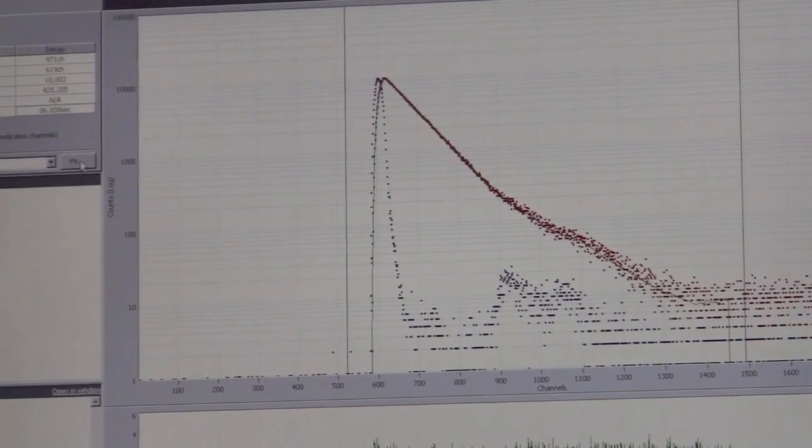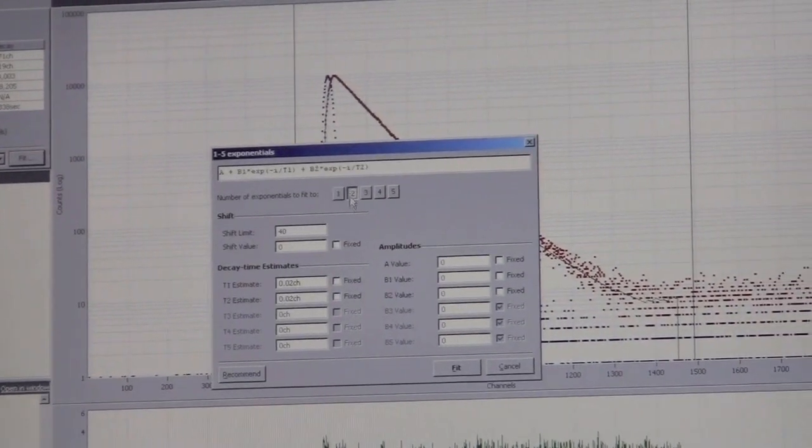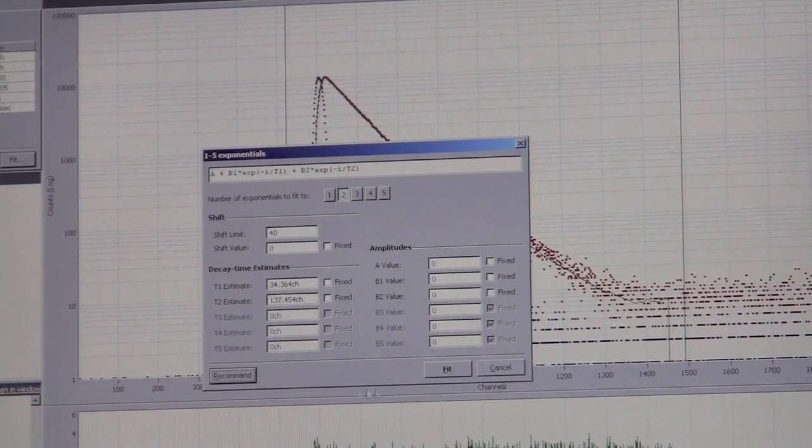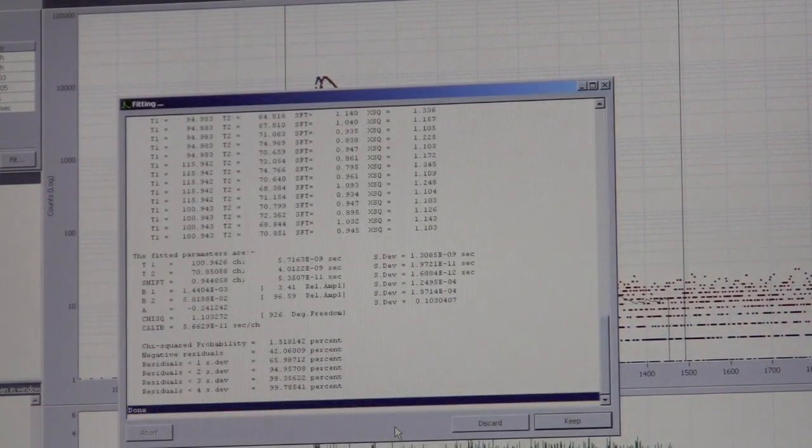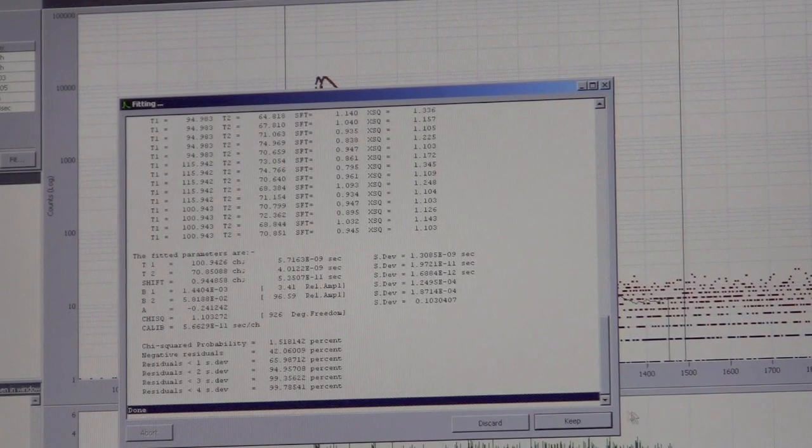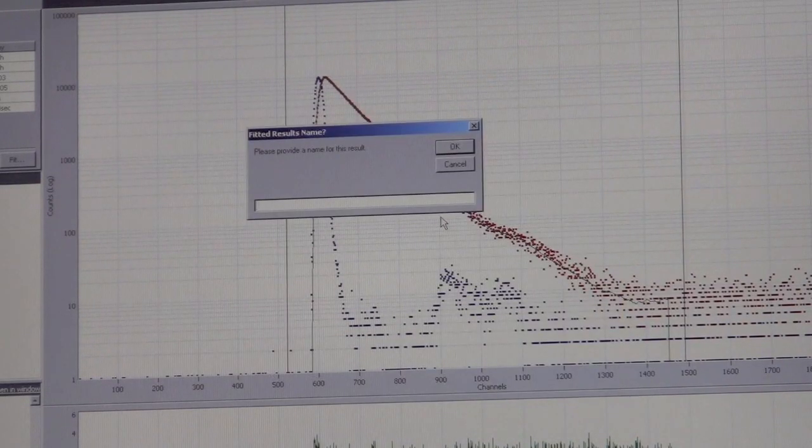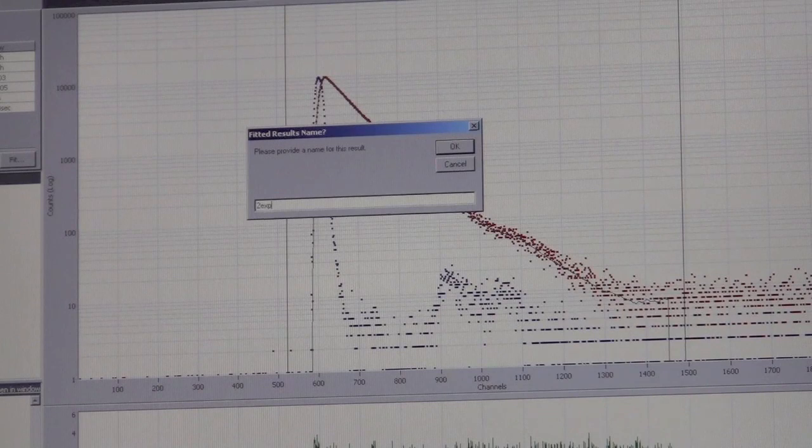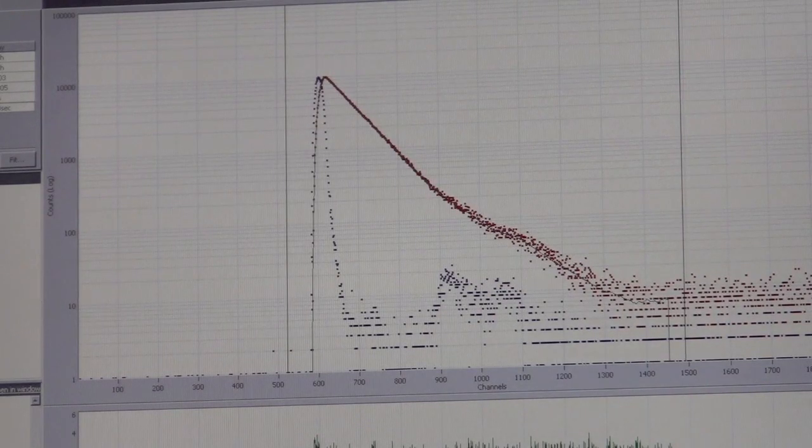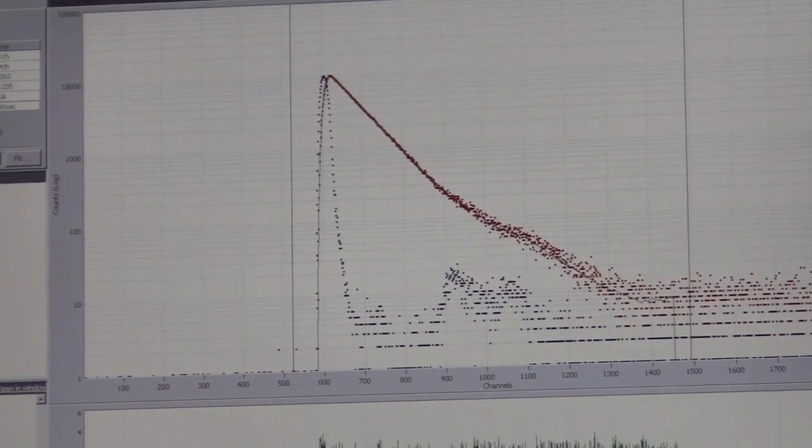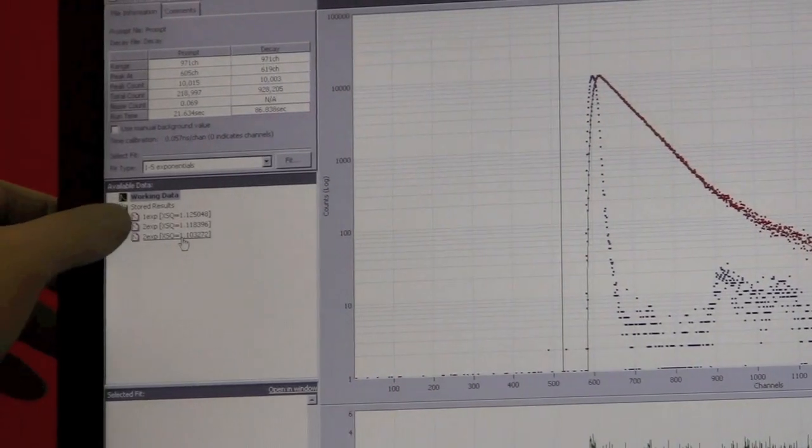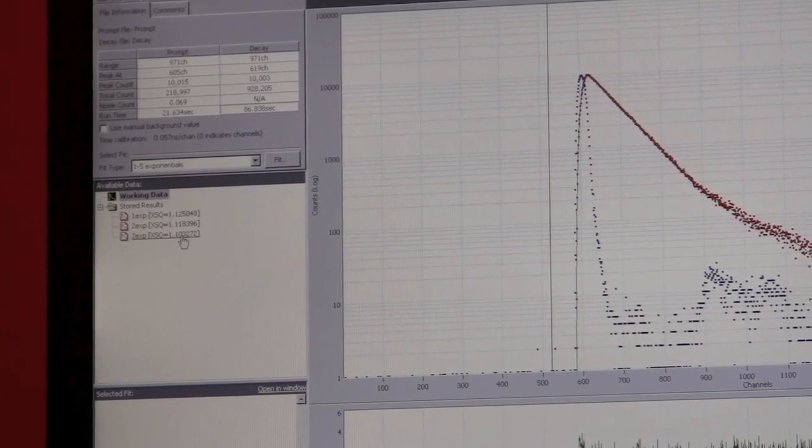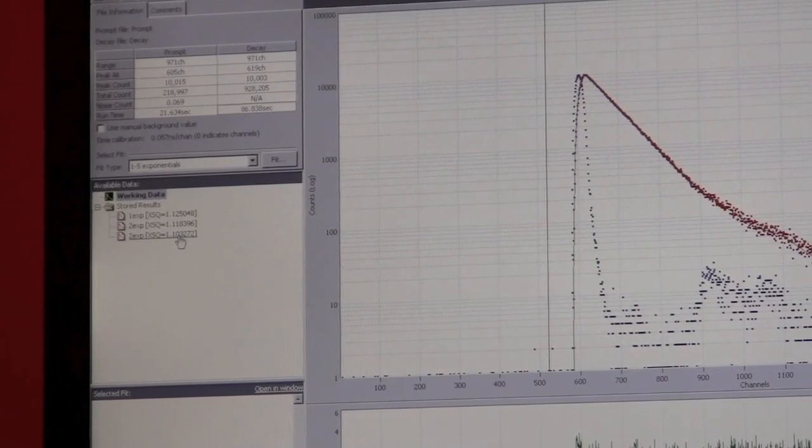We go back to the fit function and click two exponentials. Again, recommend and fit it. You can do this again and again up to five lifetimes before the instrument tells you you can't fit anymore. You can see with each fit it lists your chi-squared value. They're all still about 1.1.